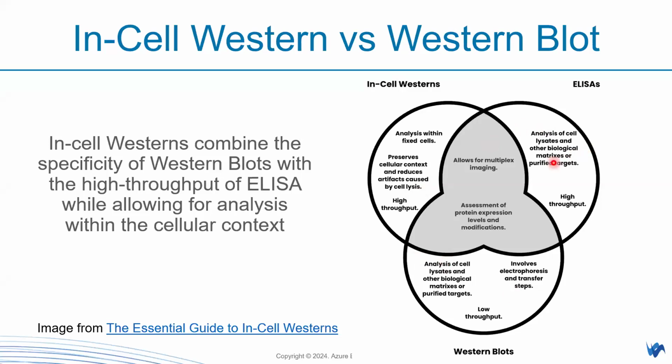Where ELISA, you can detect a small amount of target protein, and it's rapid and easy, and you have exact data that you get from ELISA. And for Western blot, we're normally looking at a wide range of target proteins, like multiple proteins from a complex sample, like your cell lysate, or you need to do some molecular weight analysis or protein modifications of some sort, and looking at the target protein that you specifically look for. The in-cell Western is a combination of both of them.